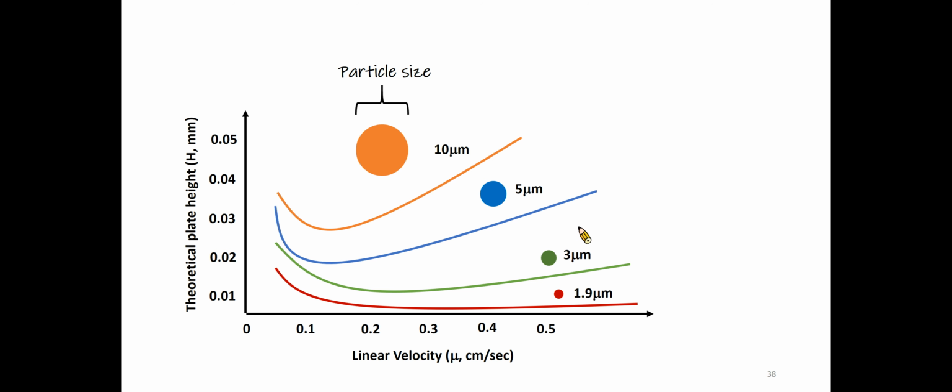Decreasing particle size has been observed to limit the effect of flow rate on peak efficiency. Smaller particles have shorter diffusion path lengths, allowing a solute to travel in and out of the particle faster. Therefore, the analyte spends less time inside the particle where peak diffusion can occur.